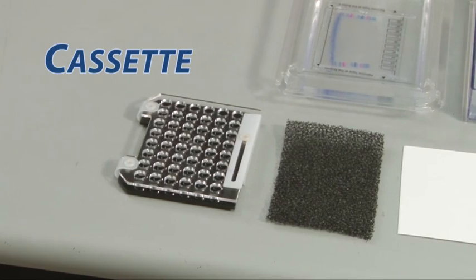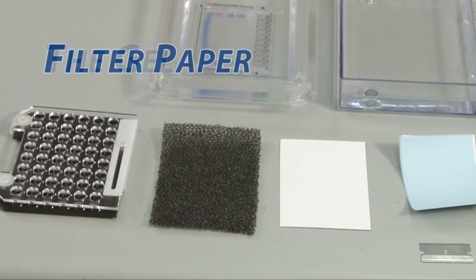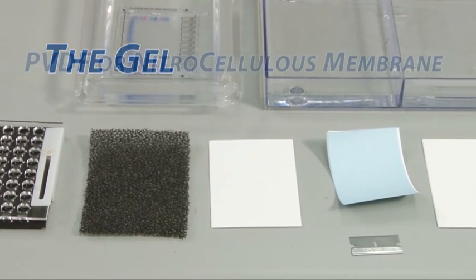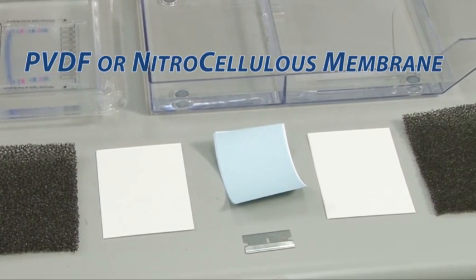To make the transfer sandwich, you will need a cassette, sponges, filter paper, the gel, and your choice of either PVDF or nitrocellulose membrane.